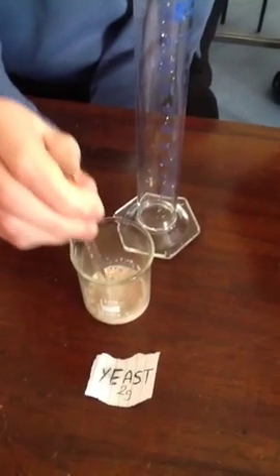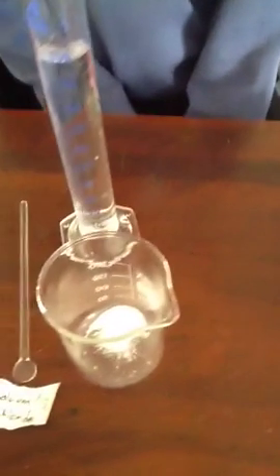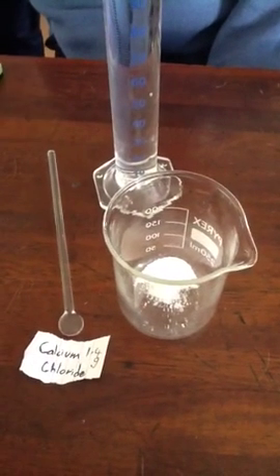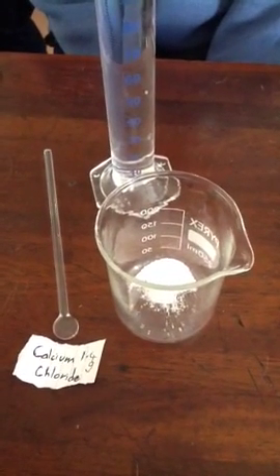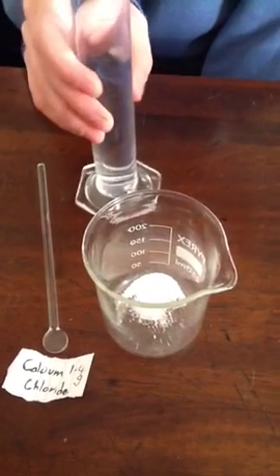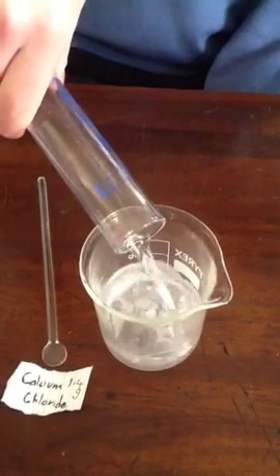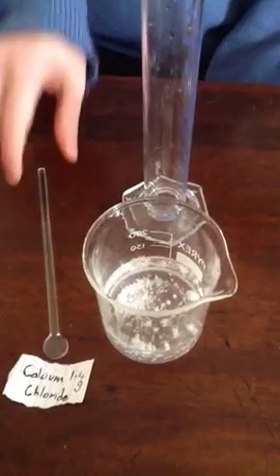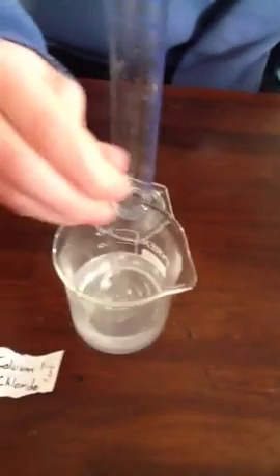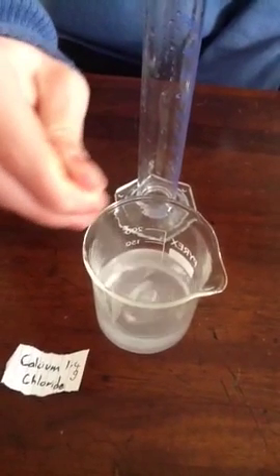So we are using the sodium alginate and we're using calcium chloride to immobilize the enzyme that's found in yeast. So what are you going to do with the calcium chloride now, Benedict? We're going to add 100 centimeters cube of water to it. That's dissolving well there.